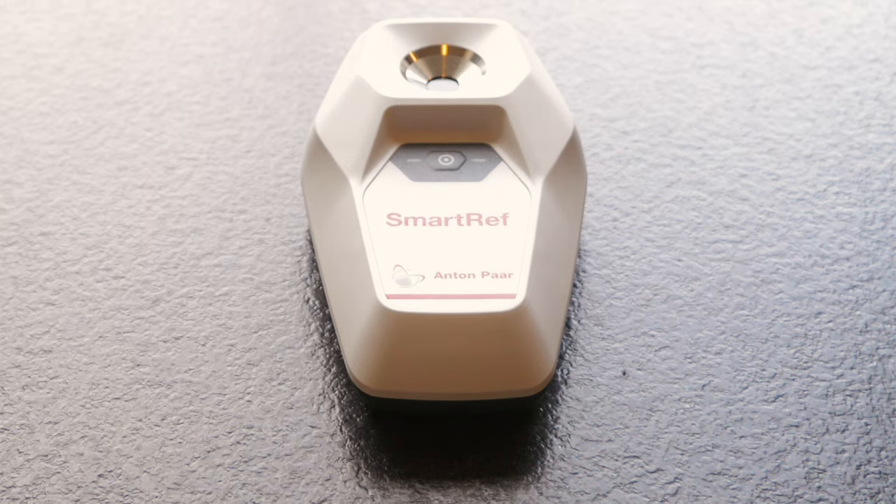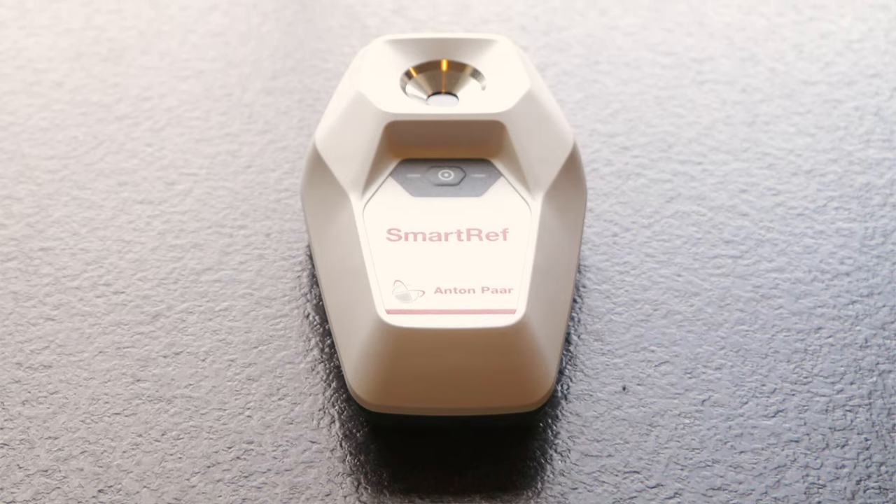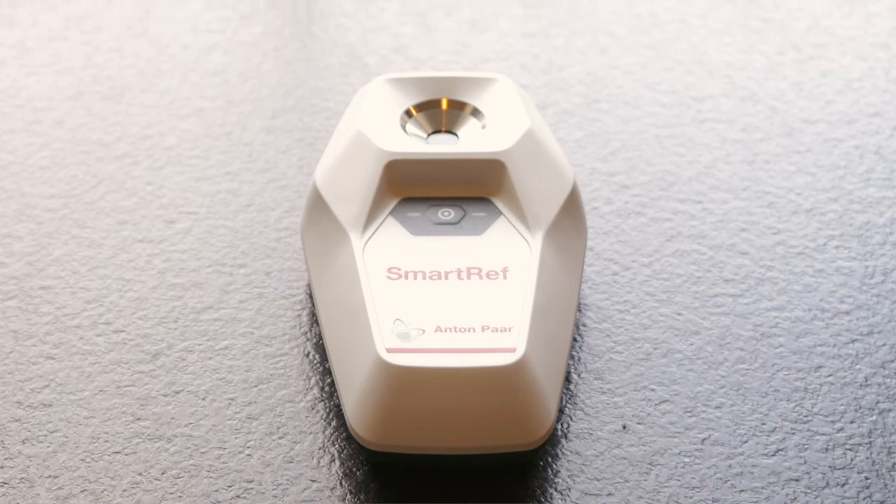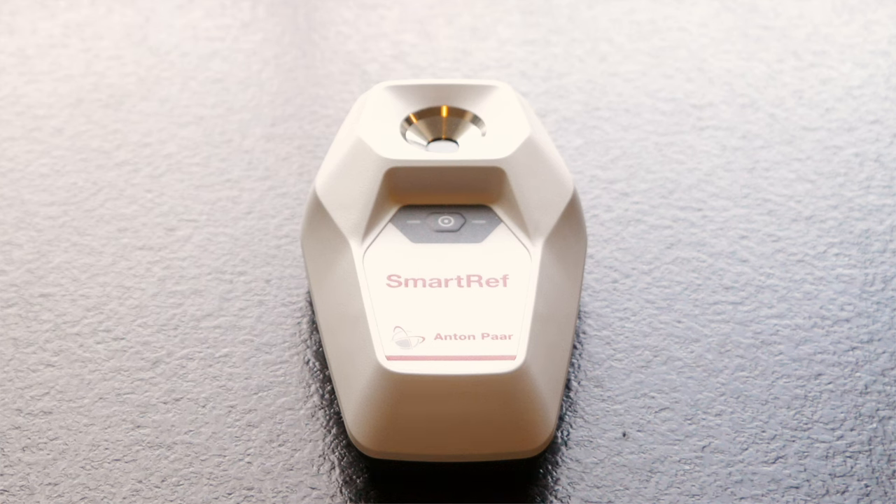This is hardly surprising as this is a device from Anton Paar, who are one of the world's leading manufacturers of measurement instruments to various industries including the commercial brewing industry. This device is intended for homebrewers use and is offered alongside the EasyDense Density Meter. I have covered both devices on this channel with reviews so check those out if you are interested. I really enjoy having a device this accurate but I understand that this will only appeal to very serious brewers with a budget for it. Due to the Smart Ref's ultra-accuracy of 0.2 degrees Brix, this is essentially our benchmark device.